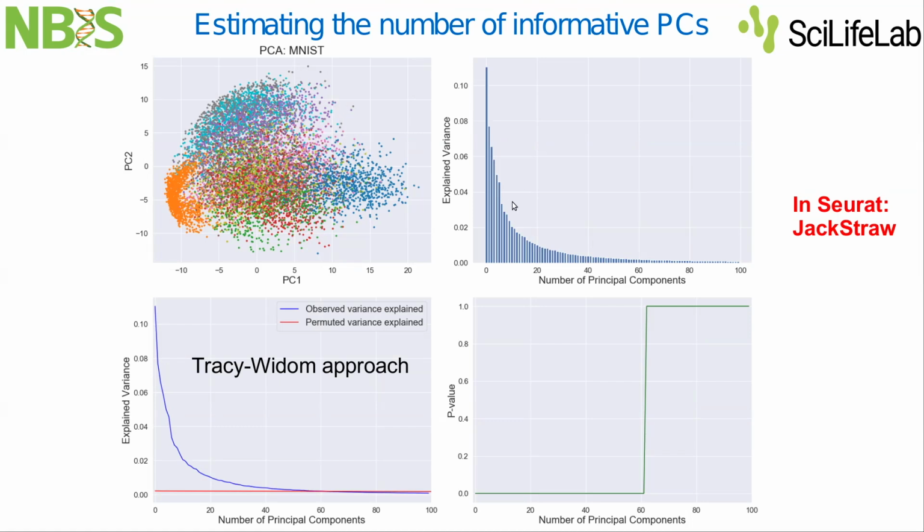So basically, if you want now to estimate how many principal components to keep, you can use some common sense and say, well, I believe that principal components starting from maybe 20 or 40, this tail of this distribution of explained variance, explains very little of my variance. It's below 1% of variation. So maybe I should cut this tail somewhere here at around maybe 40 or 60.